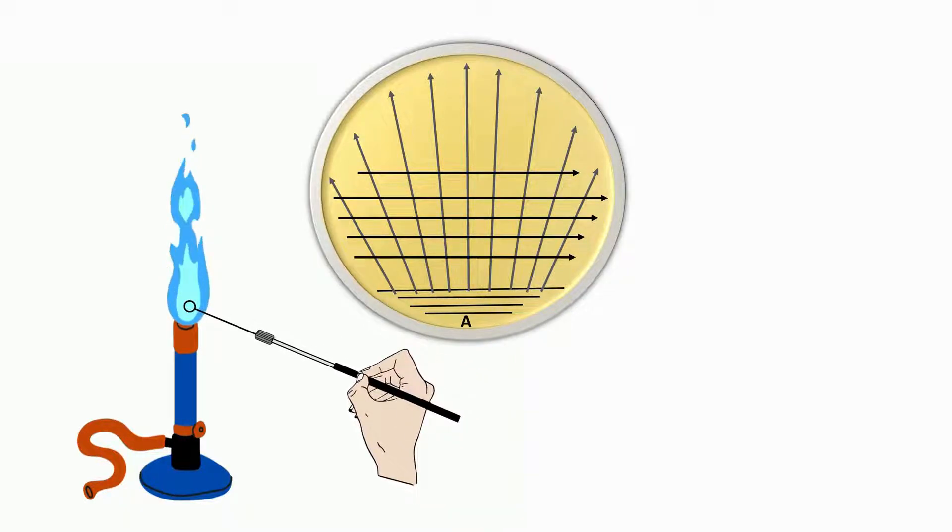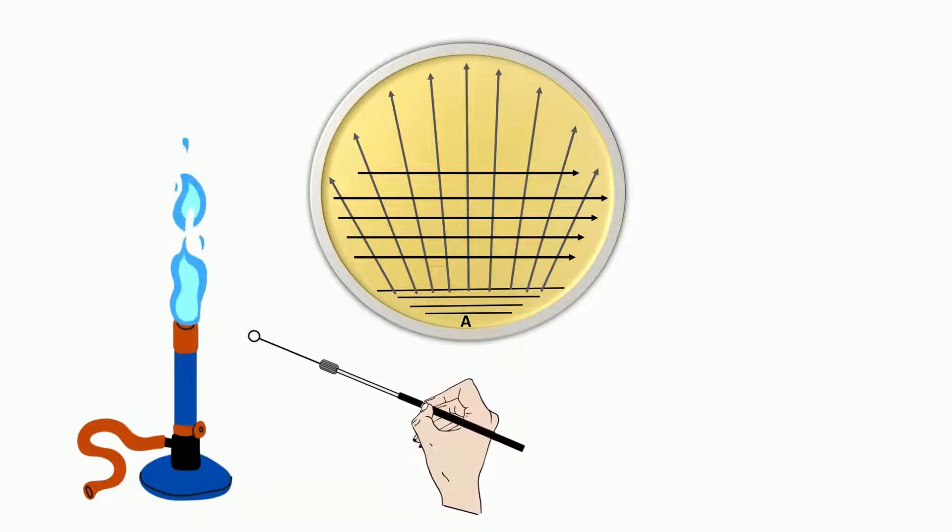Hold the loop in the flame to sterilize and keep the loop aside.